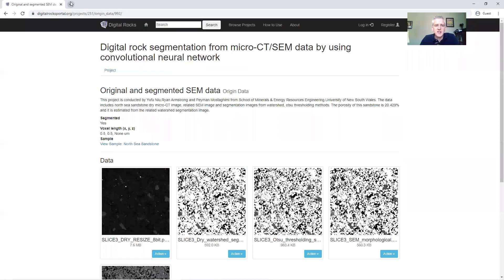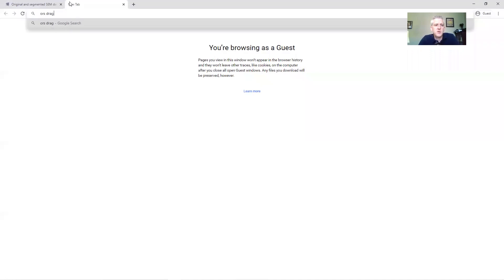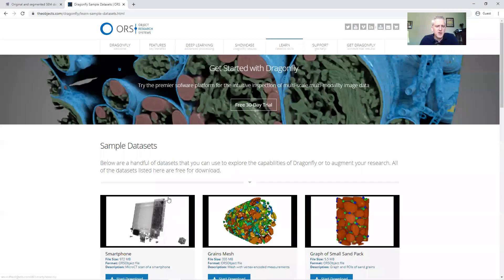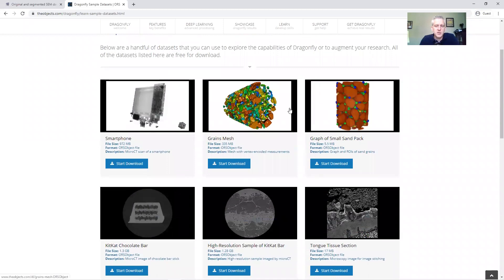The second data set we'll use today is the mouse retina data set. If you Google ORS Dragonfly and visit the Dragonfly landing page, go under Learn, then Sample Datasets, and you'll find a new object there. These are some objects used in lessons 1 through 5, and for today's lesson 8 you'll find a new data set on the mouse retina rod internal segments, thanks to Christopher Bleck.